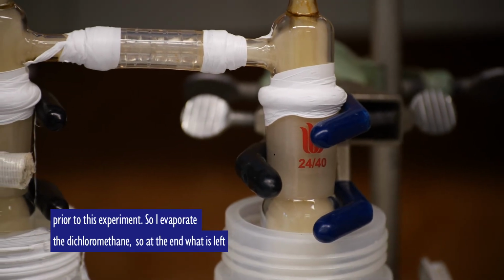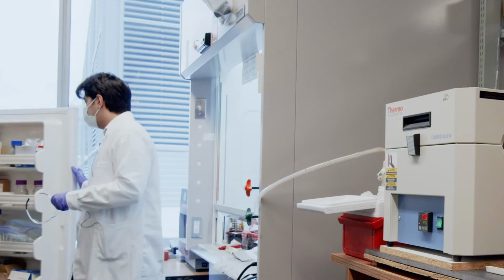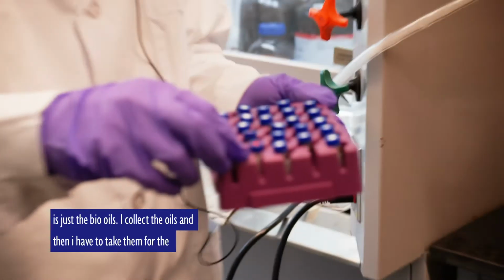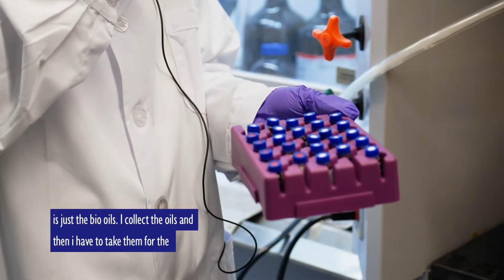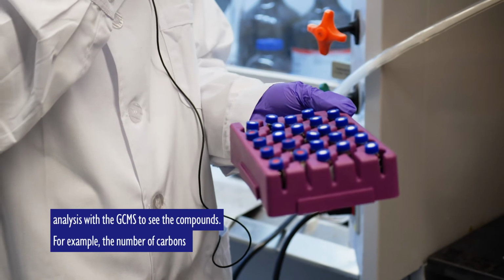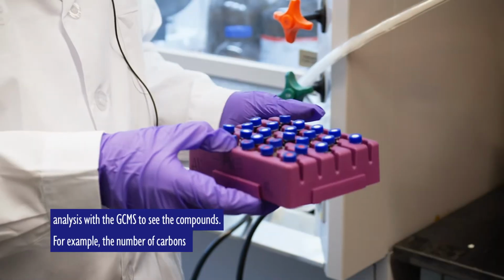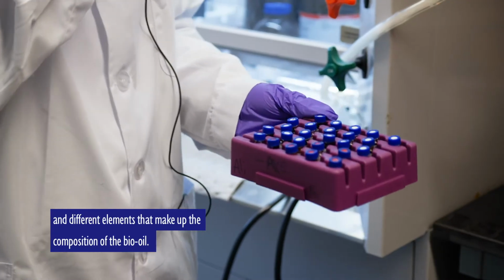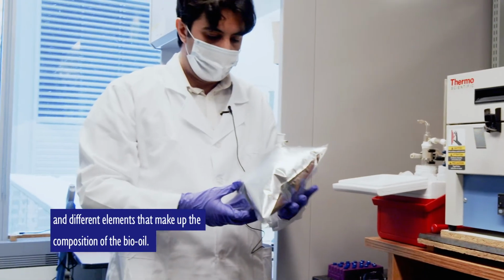So I evaporate the dichloromethane. So at the end, what is left is just the bio oils. I collect the oils, and then I have to take them for the analysis with the GCMS to see the compounds. For example, as I mentioned, the number of carbons and different elements that are inside the composition of the bio oil. What exactly do we have?